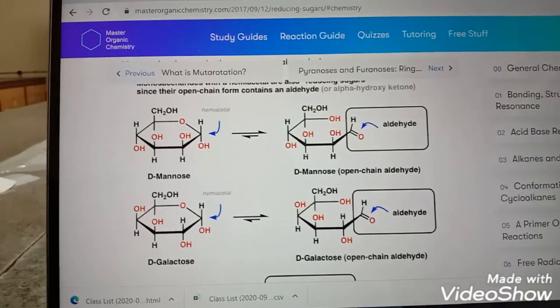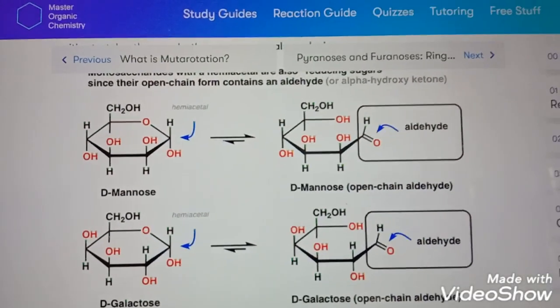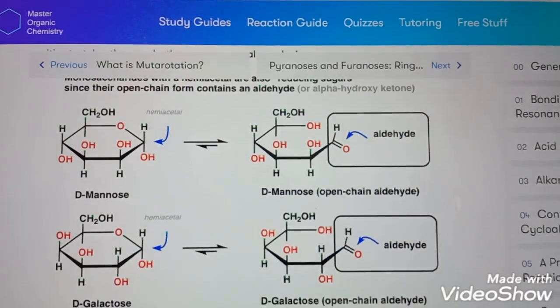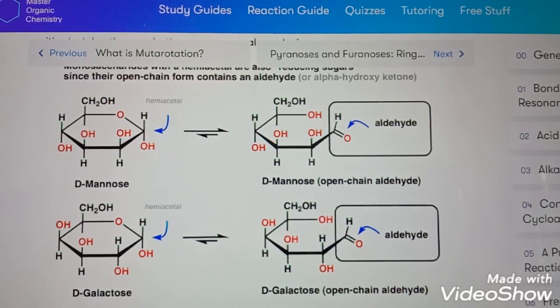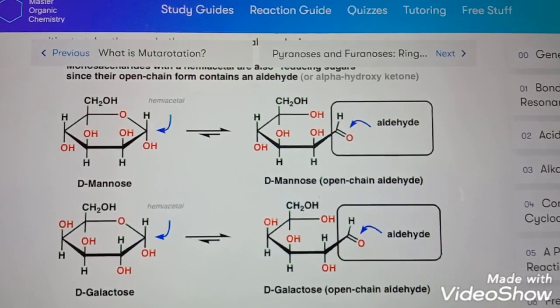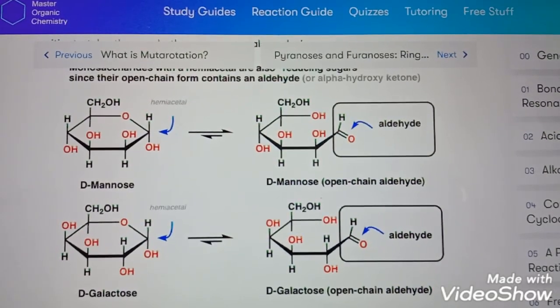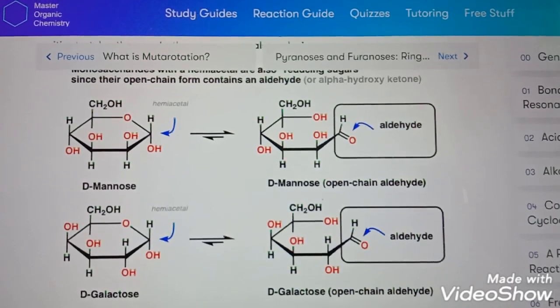Reducing sugars are considered as removal of oxygen from glucose or fructose or whatever the reducing carbohydrate may be, which we already discussed. And this reduction is the removal of oxygen or adding of hydrogen, also the gaining of electrons. This is the sharing of electrons between the dinitrosalicylic acid and the reducing glucose.